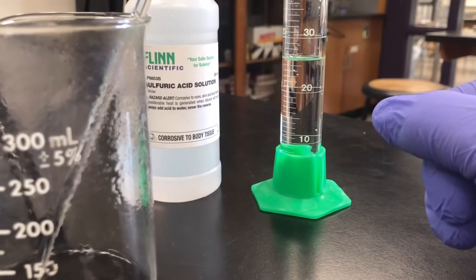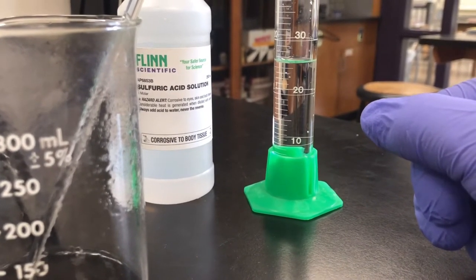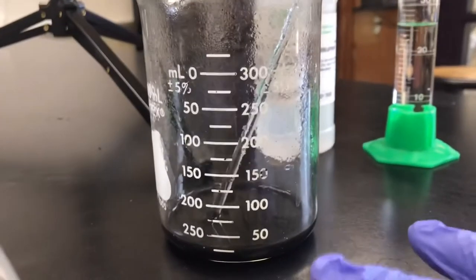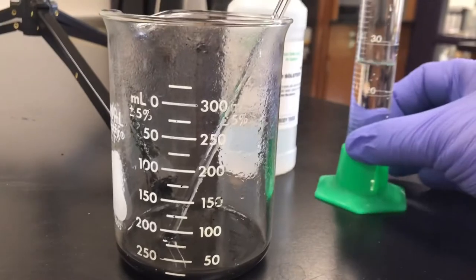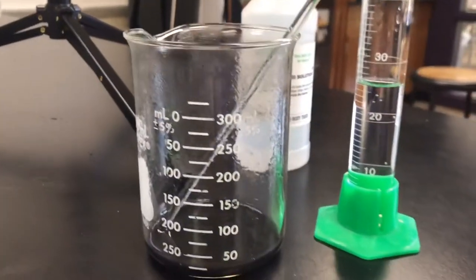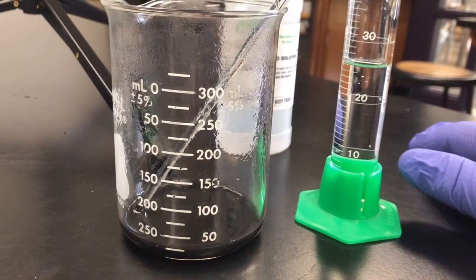We never add water to acid, but we are going to add very slowly this acid to any of the water that's in here, because the strong acid can rip apart the water molecules, creating a huge amount of heat. So that's why we're going to do this very slowly.